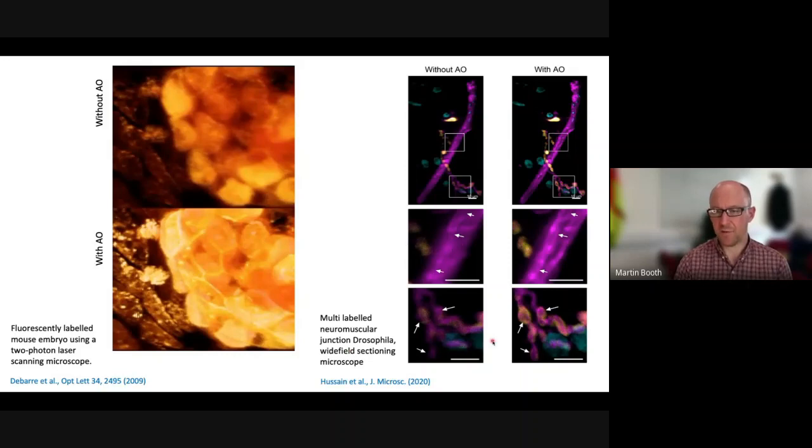The example on the right is a much more recent one where we've applied this to a wide field sectioning microscope, and the colors in here represent the three different fluorescence channels we've used.